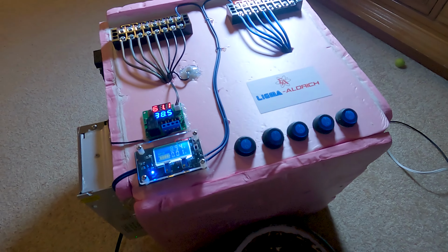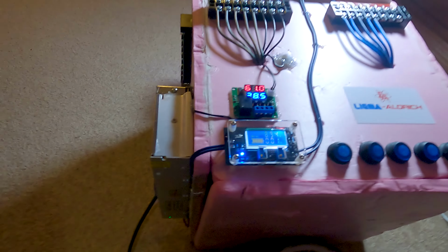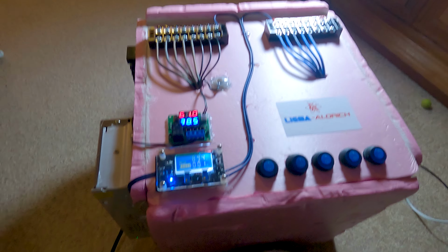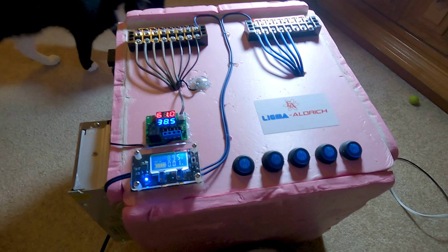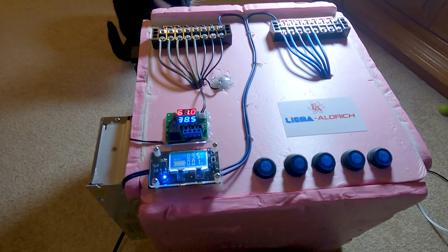Okay, we have made massive strides on this photoreactor, and my door is being propped up by a pan right now, so ignore that. Yeah, this is what it looks like. It's all wired up except for the 310 nanometer LEDs, which are the ones that we really want. That's what we're going to be running the reaction with.